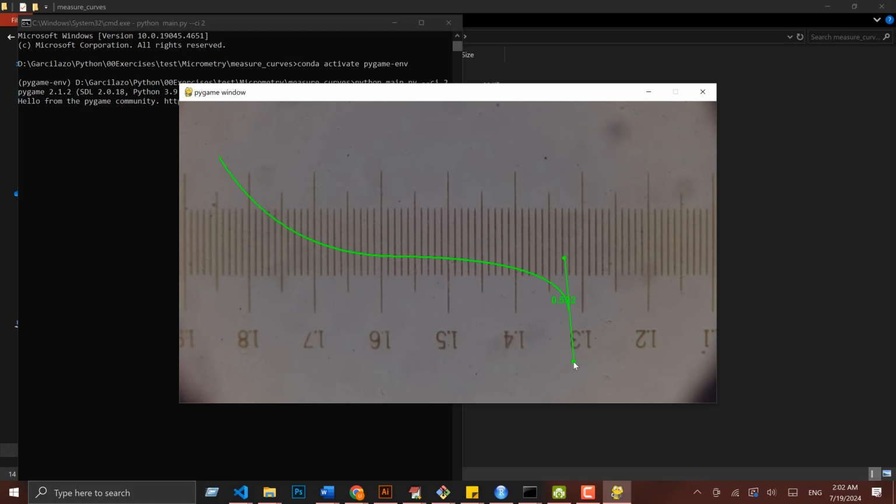But let's suppose now that I do like that curve because it matches perfectly the specimen, so I just want to confirm it. Let me release the button once more so that I get a really nice organic curve. And let's say that yes, that point and that curve match exactly what I want. So this time I just left click once, but instead of dragging, I release the button immediately. And that will create the next line in the Bezier curve.